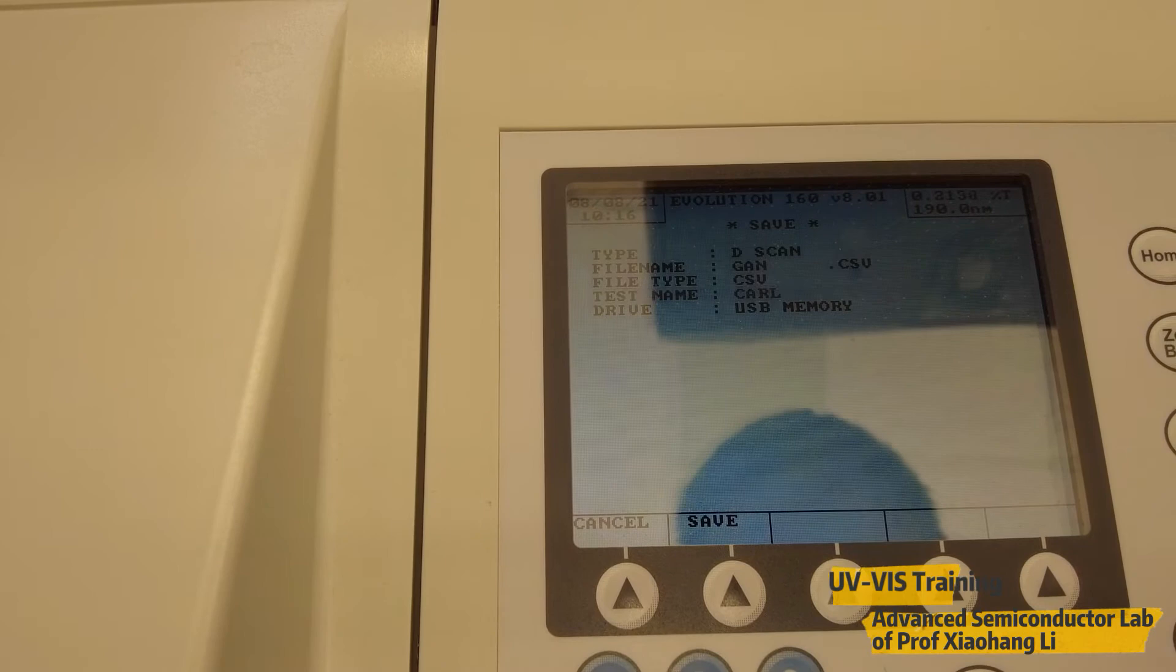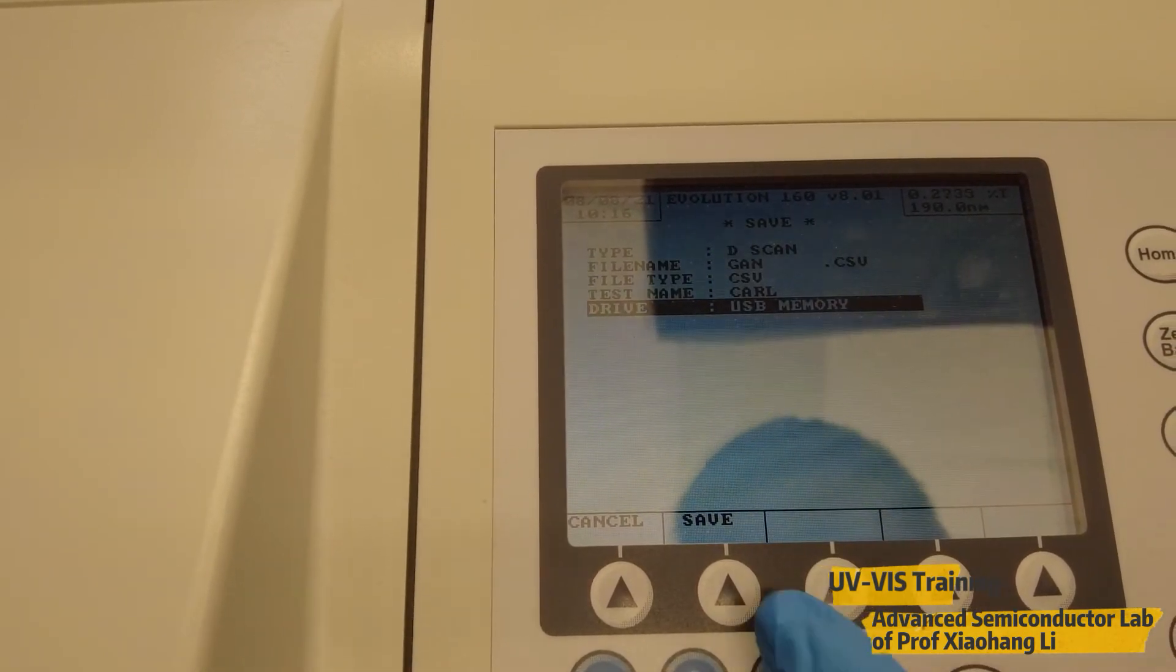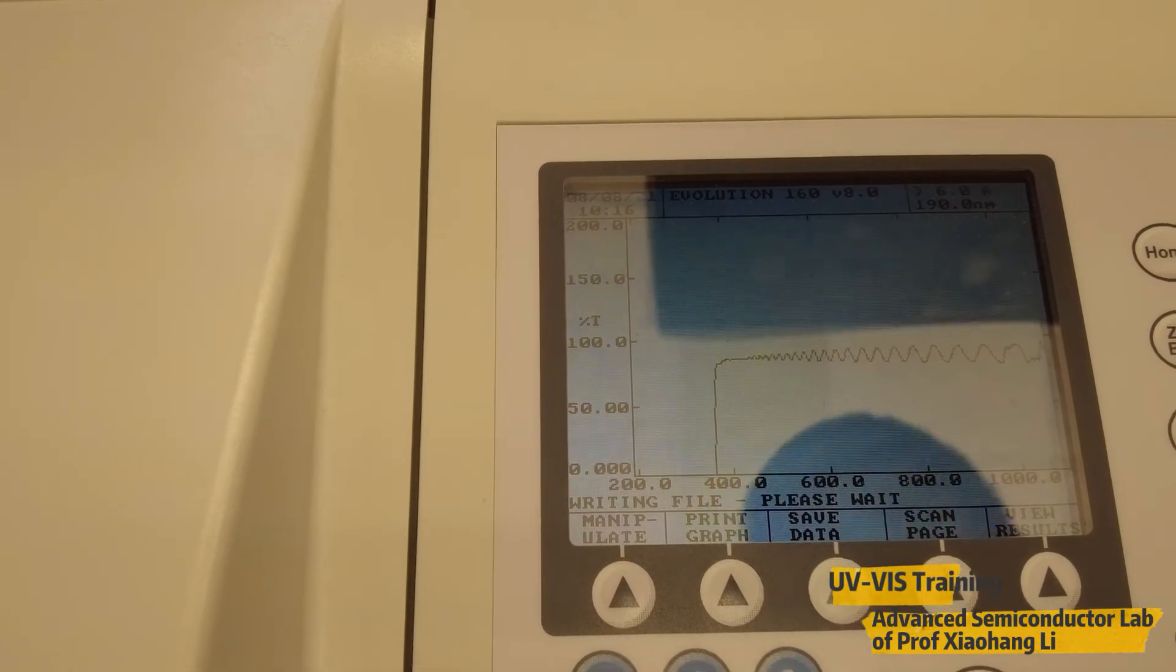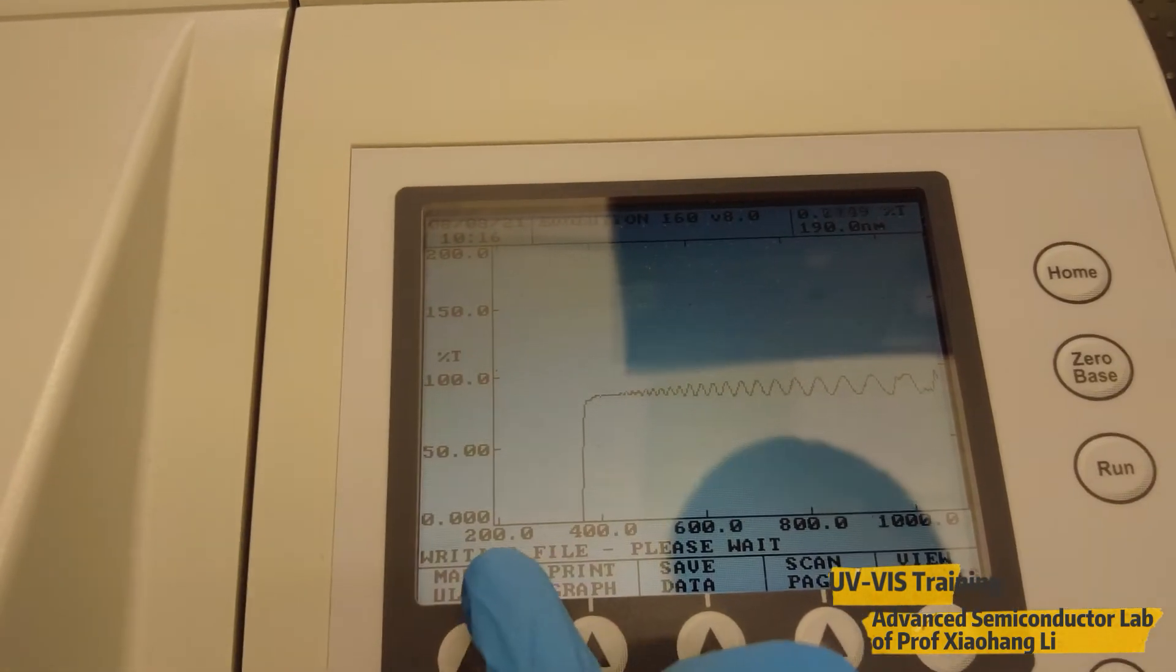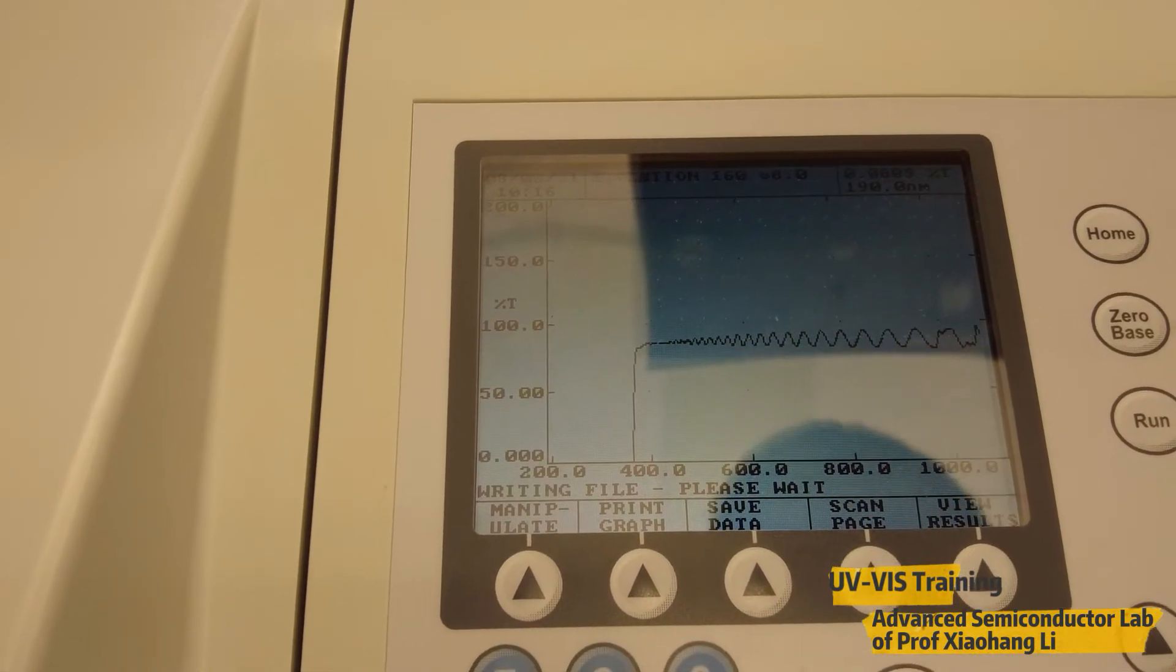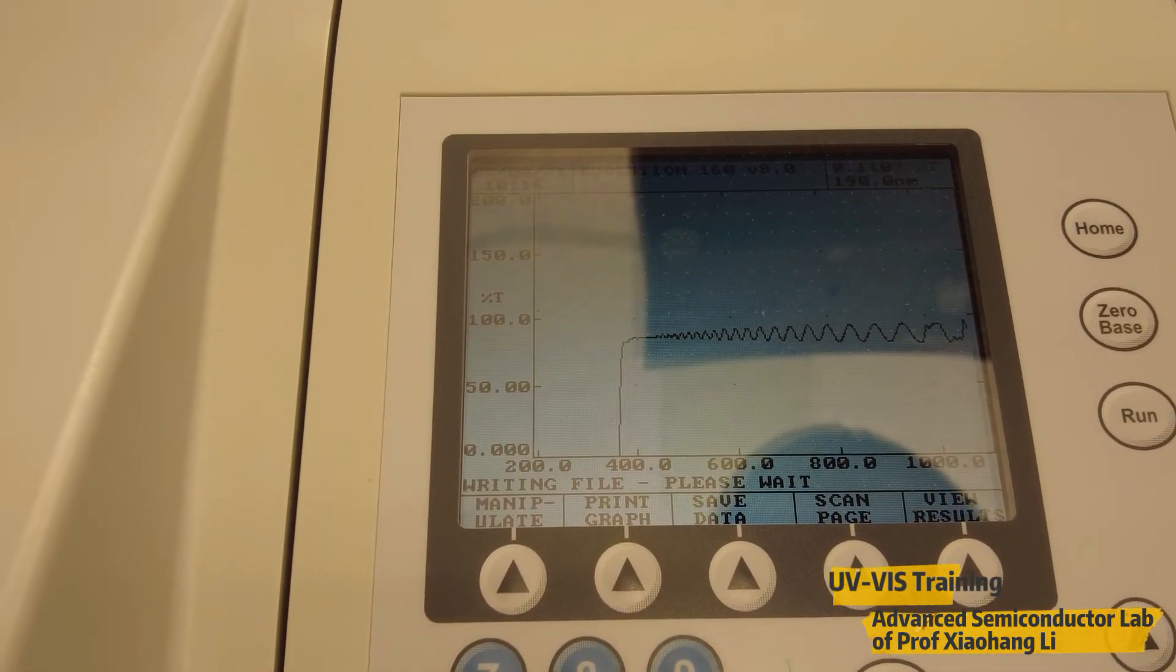Then we save to USB memory. By pressing save, it will start to save the data to our USB. Here it's waiting. After waiting a few seconds it will finish. That's the end of the measurement.